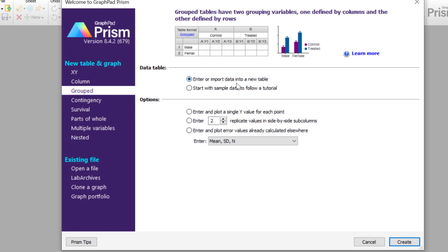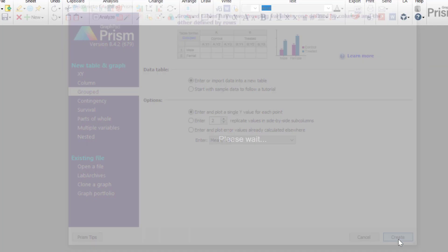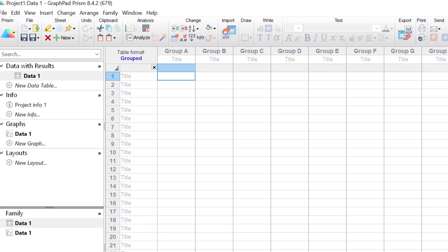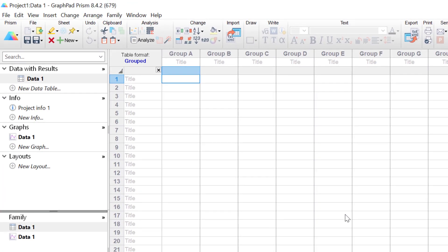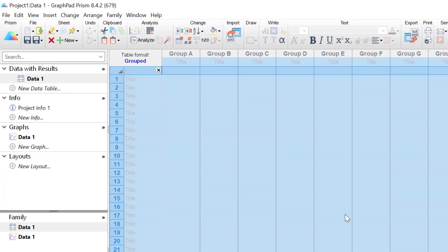I'm going to enter and import data into a new table, and I'm going to enter and plot a single Y value for each point, and then click the Create button. I will paste in the data that I've prepared earlier.